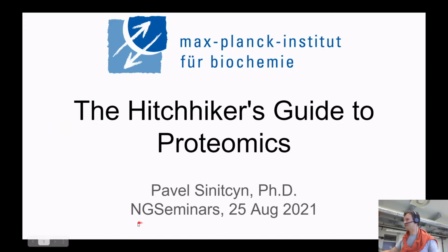So this school is called NGS School or NGS Seminar, so it's more about next generation sequencing. And as we know, next generation sequencing is about genomics and transcriptomics, everything related to the new generation of nucleotide sequencers. But I must say that proteomics is also a huge topic with a huge amount of applications. The evolution of proteomics, I think, is achieving the level of current transcriptomics state of the art. Not single cell, let's say, we're soon going to be there, but in general, proteomics is a way to go for many applications. Let's discuss which ones.